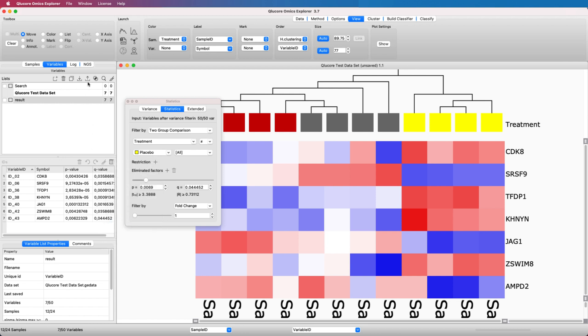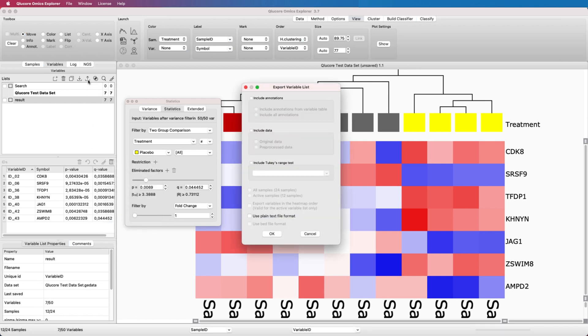Let's add the gene symbol, PValue, QValue. Then, to save the list, click Export List to File.